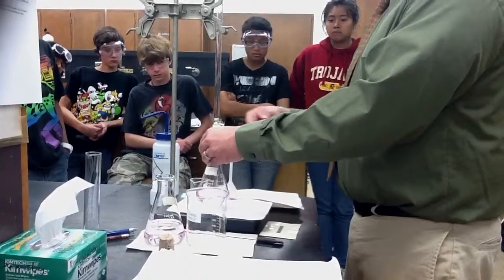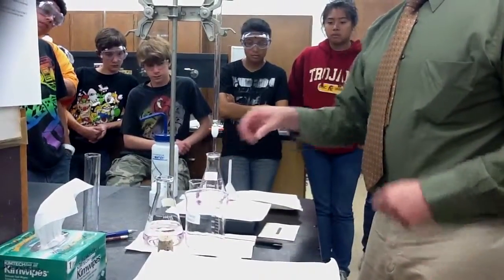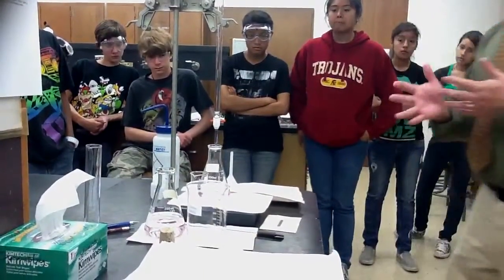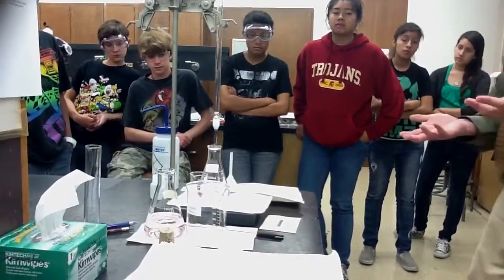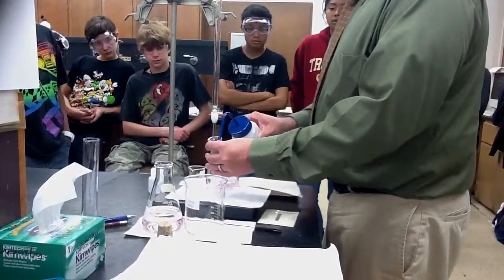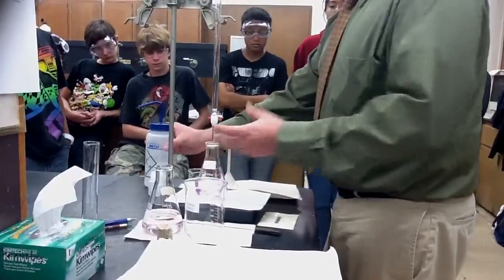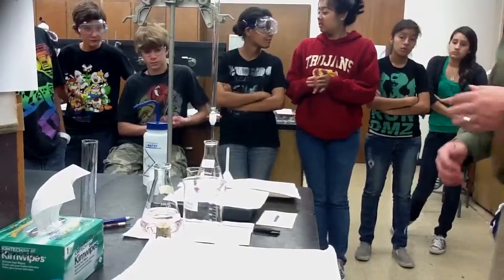There we go. Alright, now I'm gonna stir. I'm gonna back off. Now there is one there also. I'm gonna see if I use it or not, but I'm gonna wait 10 seconds. Okay? And since it's not changing, it pretty much makes the equivalence point. And I'll just grab that and squeeze around here, collect it, and that's it. Done. See? So that's what you want to get.